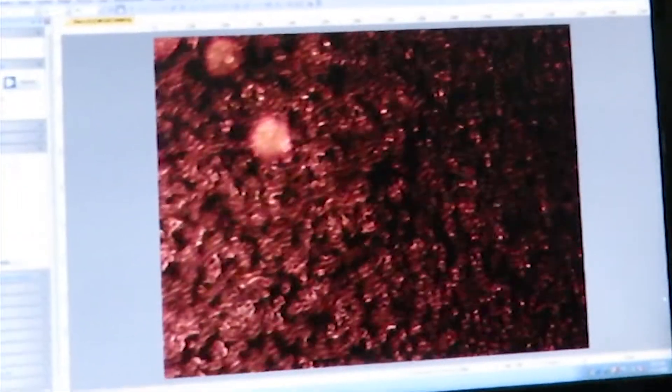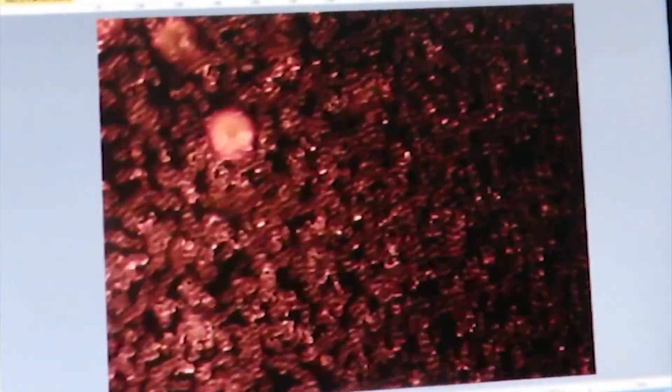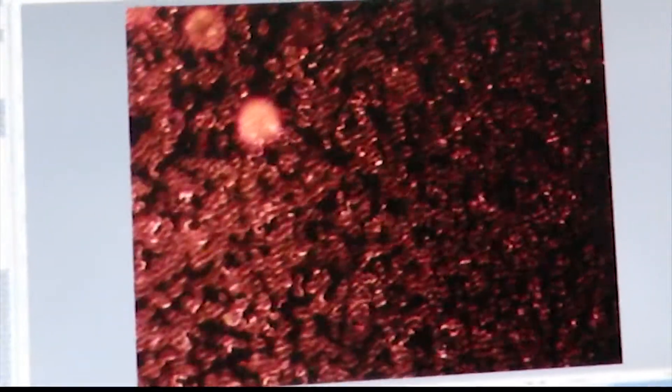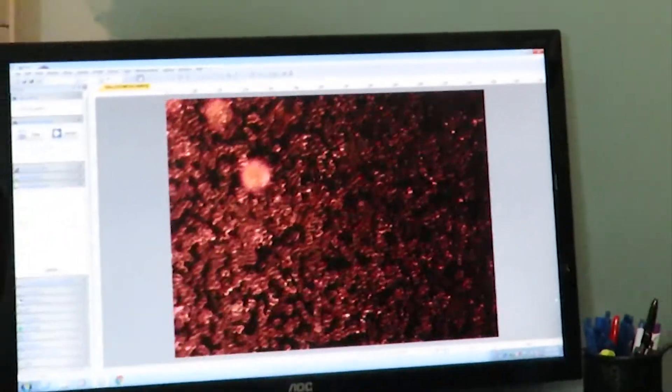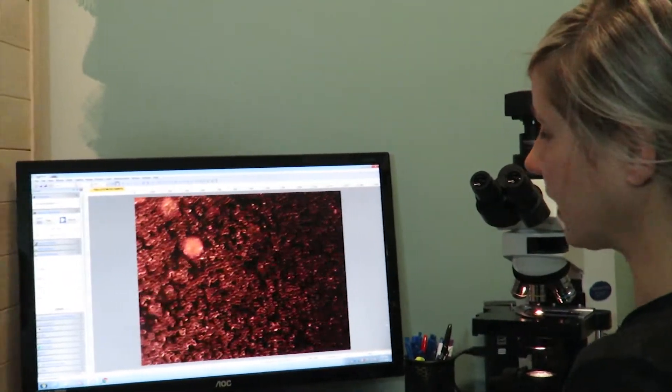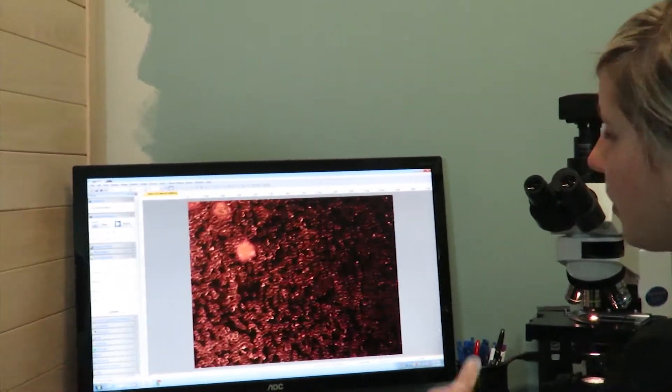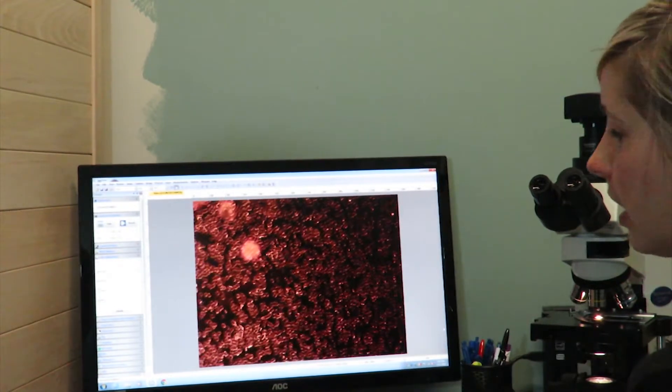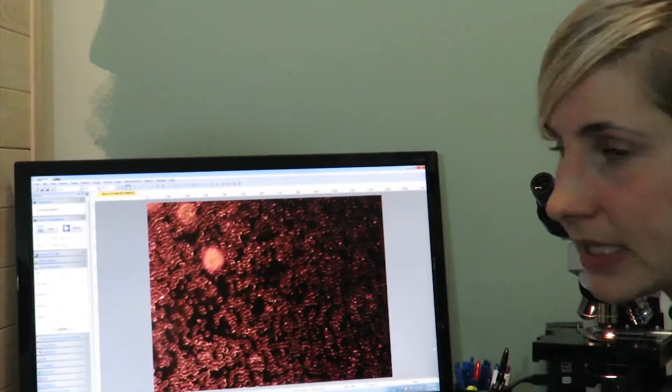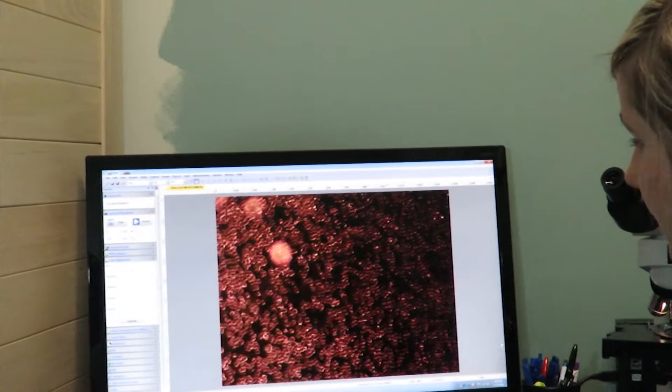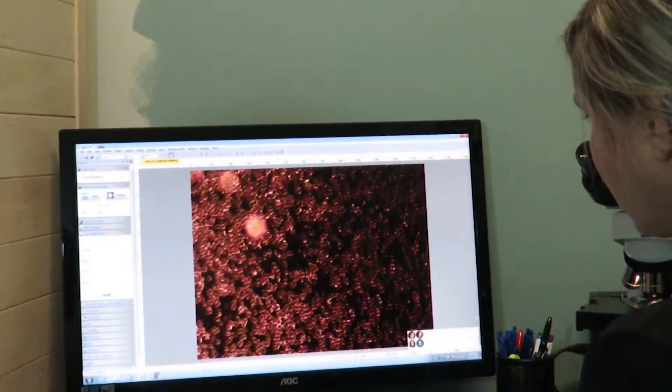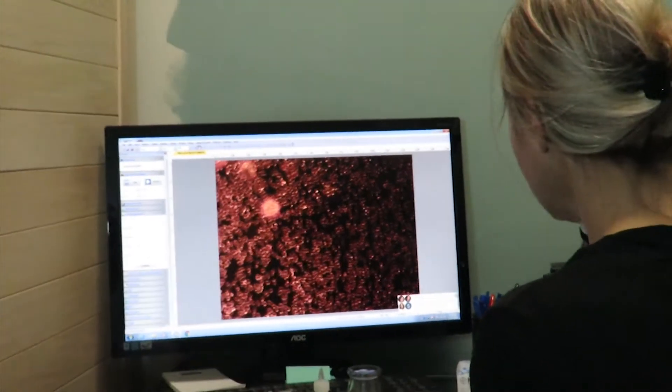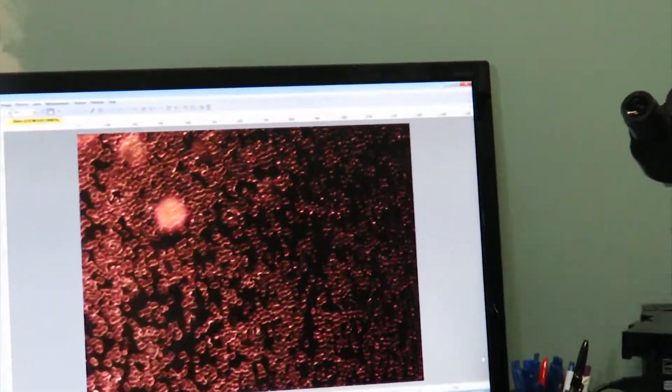Somebody's got a good heart. He's got a good ticker. This is fantastic. This is what we want to see. The red blood cells flying off the screen. They are moving so fast. That is crazy. I'm going to focus in so people can see. You're likely full of energy, feeling really good, strong, and healthy. This is kind of indicative of that.